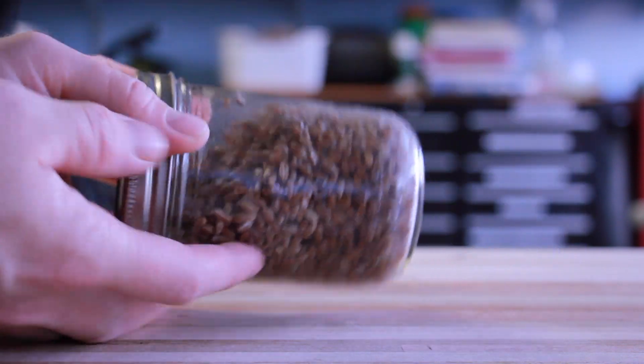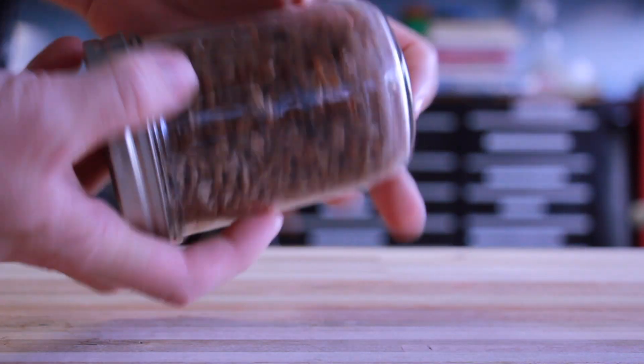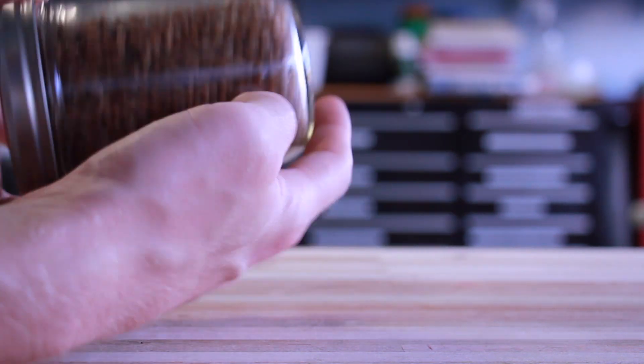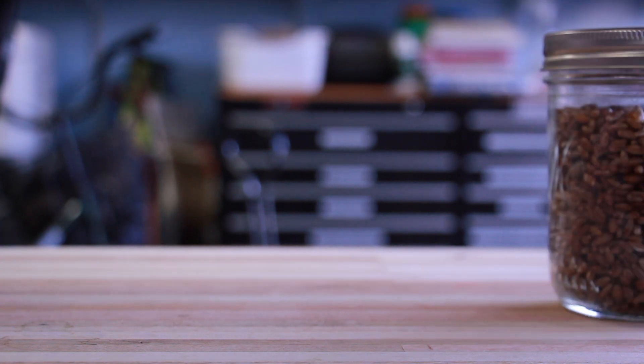Now you can see how the colonized grain and the new grain look quite a bit different - the colonized grain is nice and white and the fresh grain is a little bit darker. I gave both jars a pretty nice mix and I'll set them aside back out in the garage, and hopefully it colonizes pretty quickly.